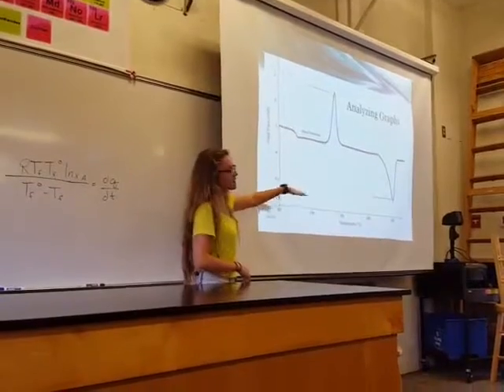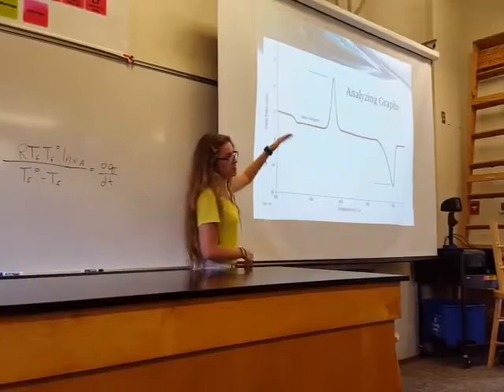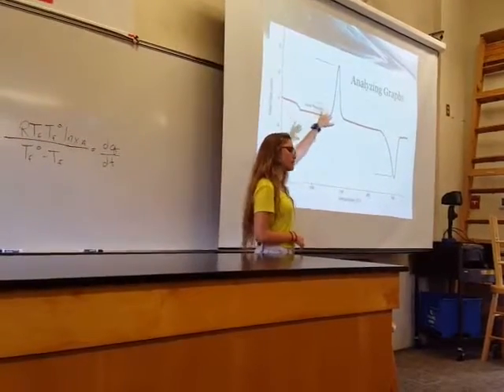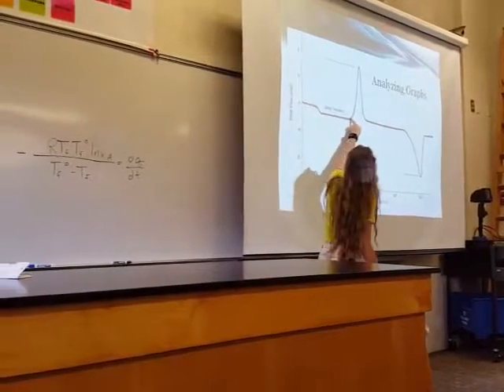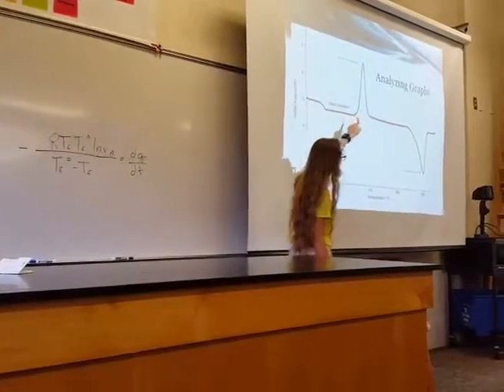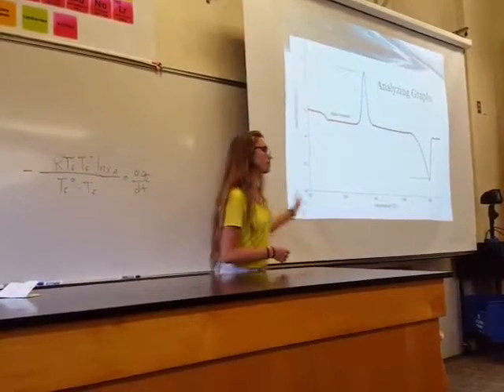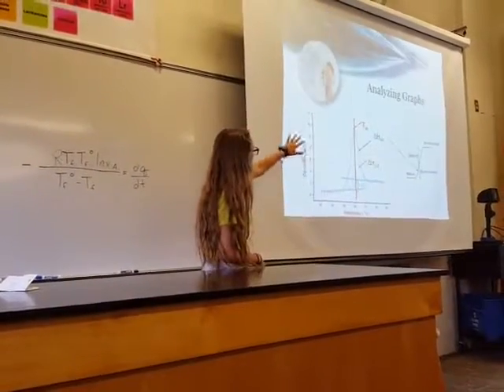Okay, so the basic analysis that we're able to get out of a differential scanning calorimeter is the phase changes. That's the major part that's measured. So from solid to liquid, liquid to solid. And so whenever we see a positive or an upward peak, that's indicating a melting point at this point right here. And this shows the end of the curve. The area under the curve is the enthalpy required to cause that phase change. And then the downward pointing curves are the freezing curves.